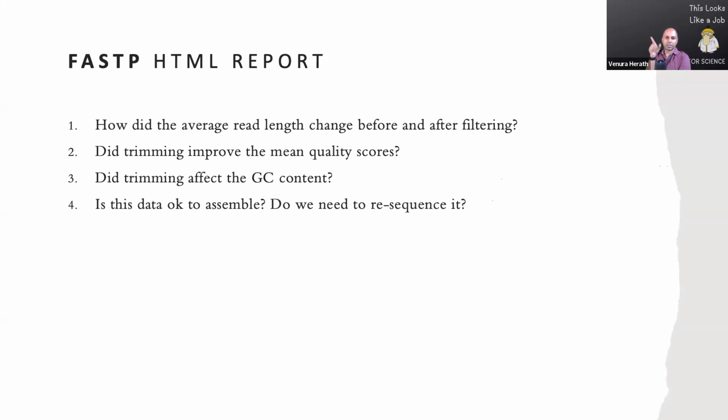You can just say, before filtering, it's how many base pairs, and the range. Hasnat, the reason for the tags disappearing is that you need to click the save button, otherwise they will disappear.